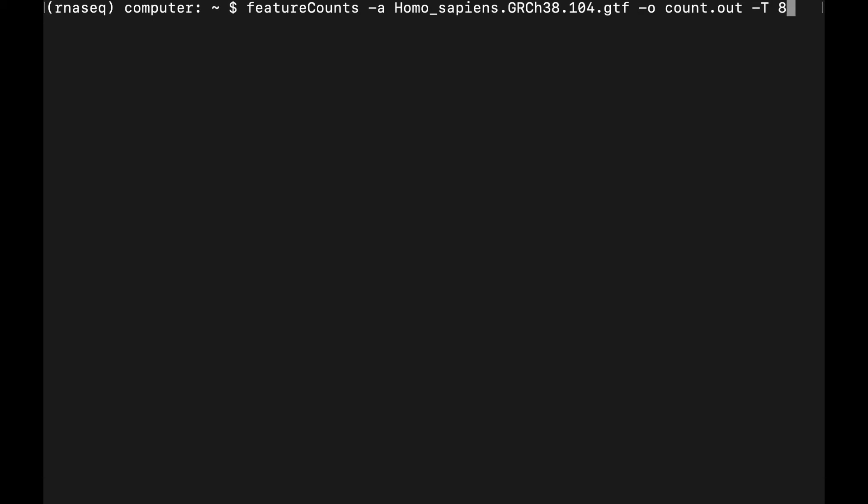And then we can point to the BAM files, which in this case are saved in this BAMs folder, and they're the only thing in there. But if you add other stuff, you could add a flag.bam, and it should pick up only the BAM files.